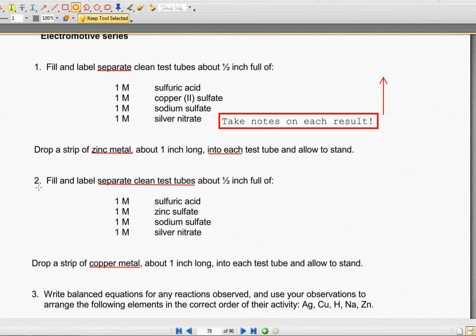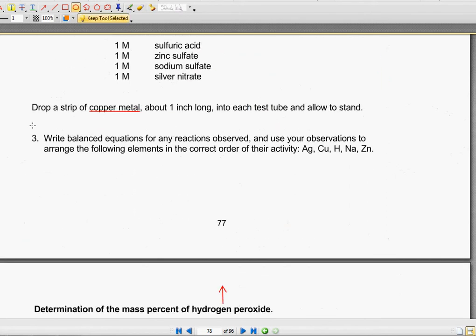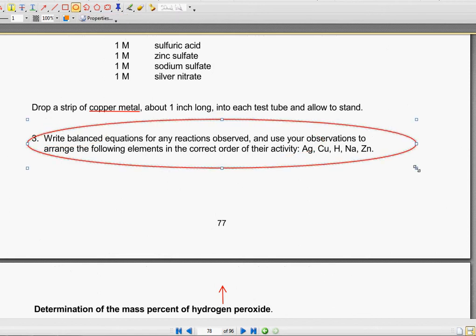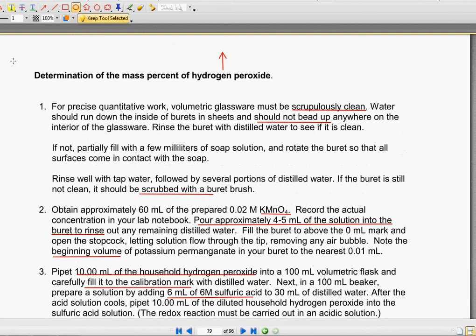So then we're going to fill another four vials with copper instead of zinc, and we're going to observe what happens. And so hopefully you will, and we're going to write out balanced equations for each one of these reactions.